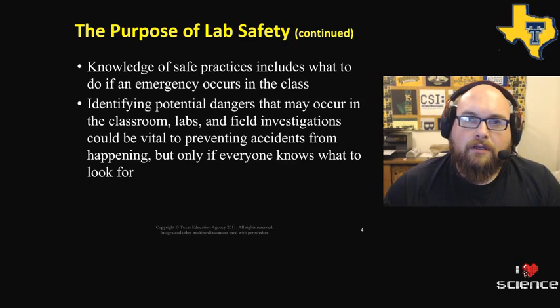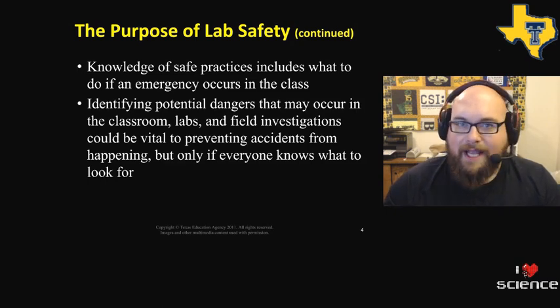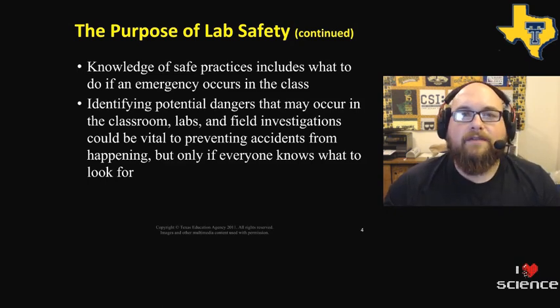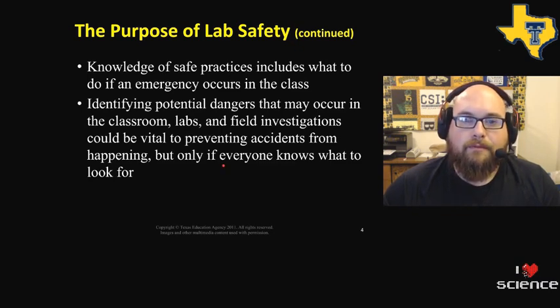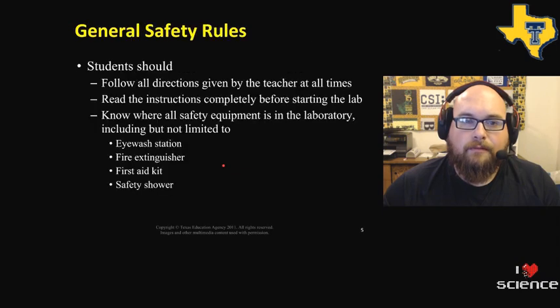Labs are usually going to be set up in the classroom beforehand, so there will be materials out and about in the classroom. Please make sure that when you come into the classroom, you do not touch anything until those safety precautions have been discussed with the entire class. This is to maintain a level of security for all people in the room. So that is very, very important.